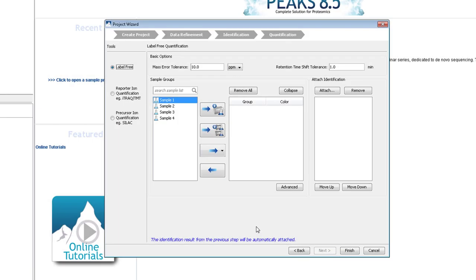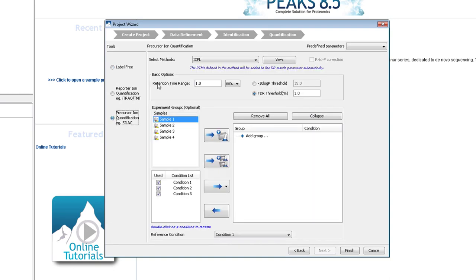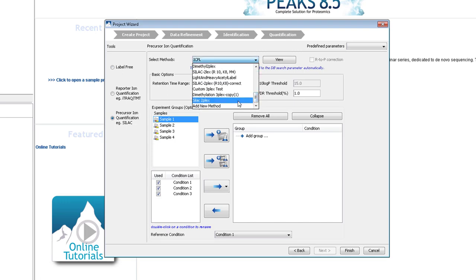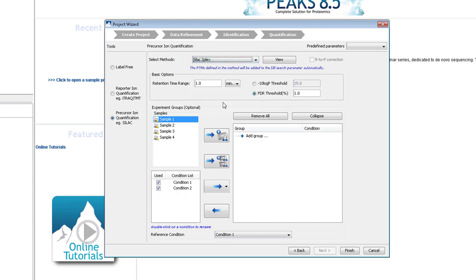Coming back to the project creation wizard. At the quantification step, select Precursor Ion Quantification from the left. Then, select the Label method from the top drop down menu. Set the retention time. This is the maximum allowable retention time shift between the heavy and the light label. 20 seconds is usually enough.